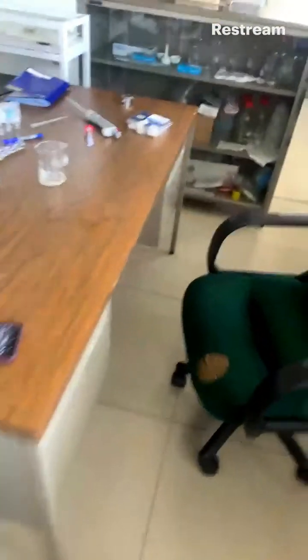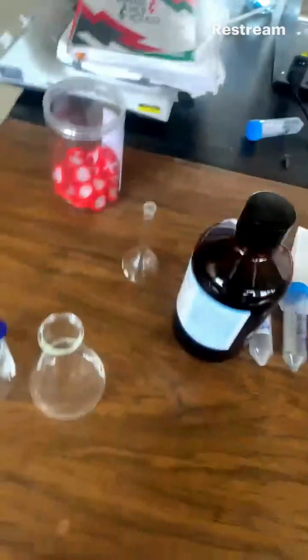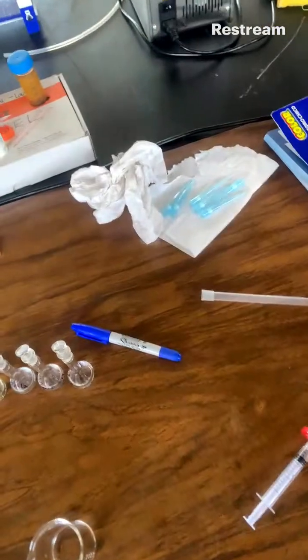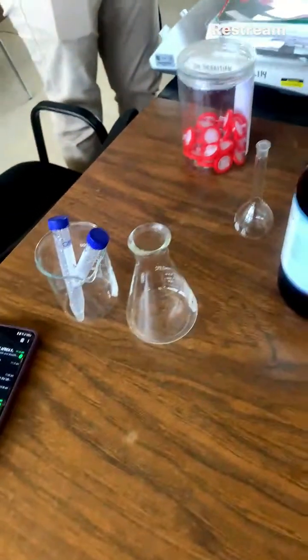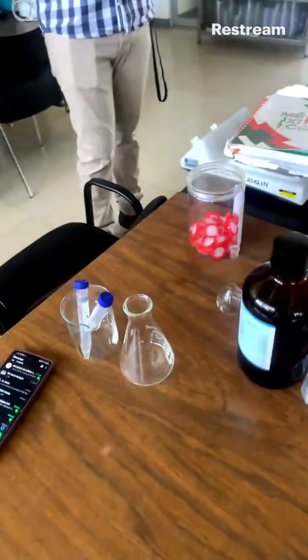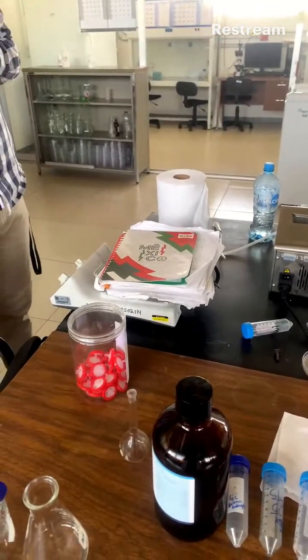All right, guys. So I think I have prepared the samples for this. Alan, buenos días. ¿Cómo estás? Yeah. Fine, fine. I'm still working with my samples. I'm testing my samples, glycerol carbonate where the catalyst is agave.